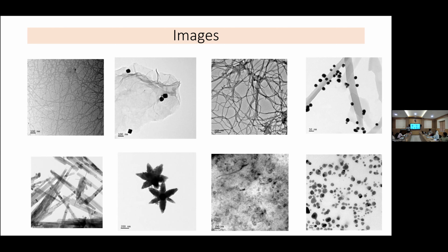So if you have some sample, then what information will we get from a transmission electron microscope? This kind of images, and then SAED patterns, selected area electron diffraction, which is similar to our X-ray diffraction. Then lattice fringes images, and then EDS data and EELS, electron energy loss spectroscopic data. So those are analytical techniques. These are imaging techniques.